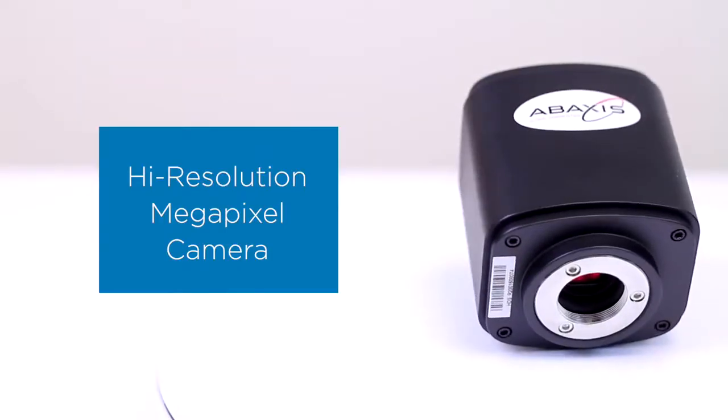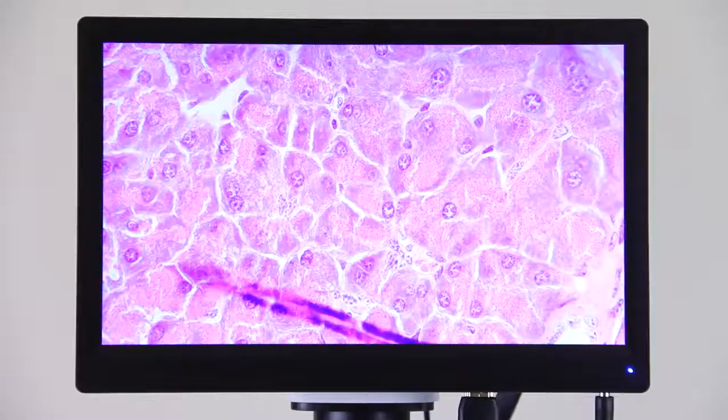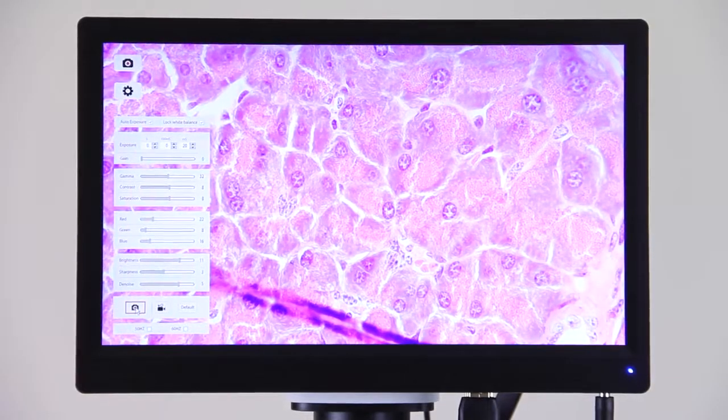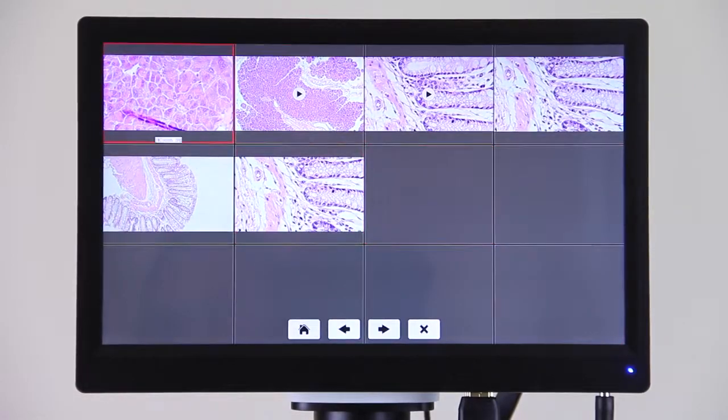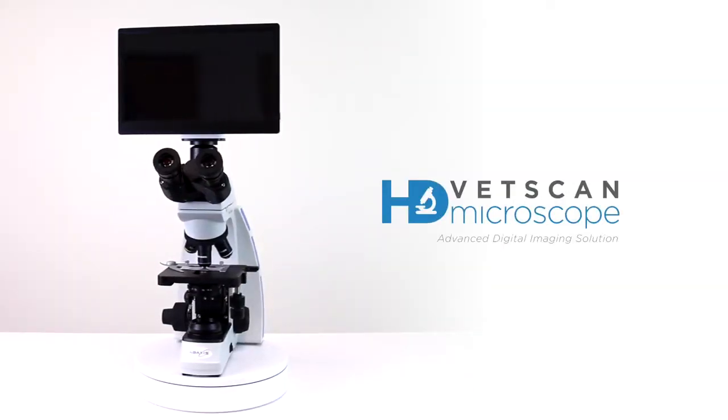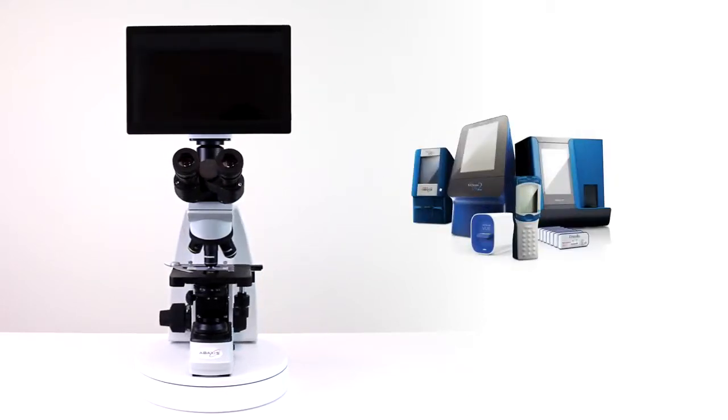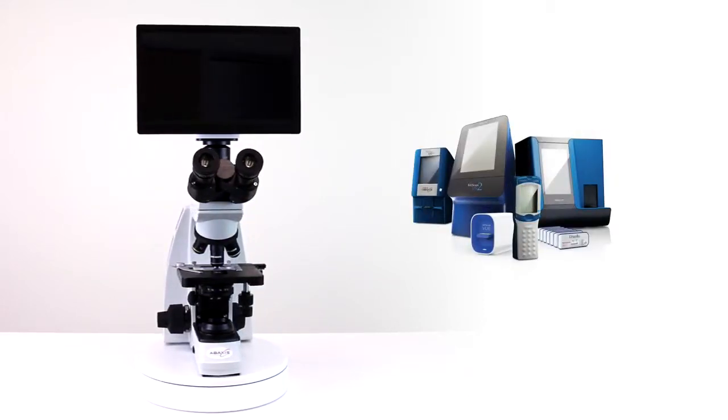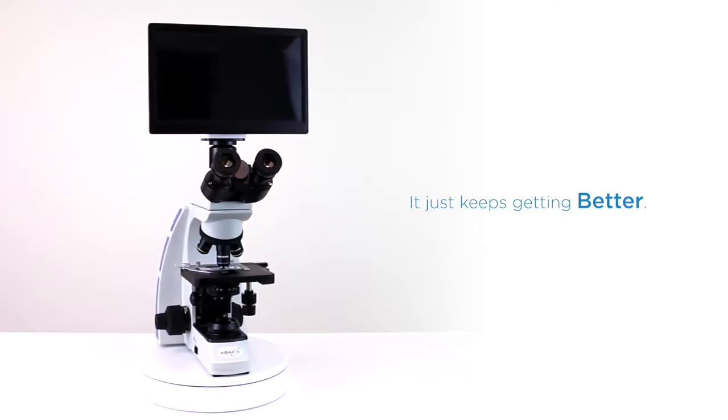The high-resolution megapixel camera allows you to capture or stream live images to your clinic workstation or the onboard software with the click of a mouse. The VetScan HD Microscope, another addition to the Abaxis suite of comprehensive diagnostic solutions. It just keeps getting better.